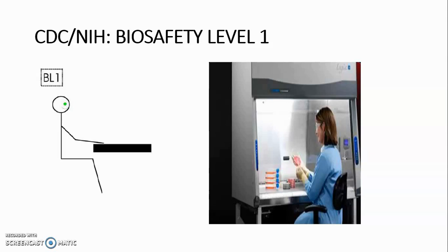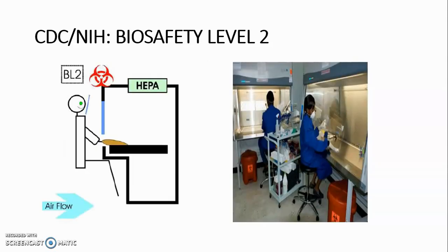Biosafety level 2 contains agents associated with human disease — microorganisms of moderate potential hazard transmitted by contact, ingestion, or puncture. BSL-2 is generally required for any human-derived blood, bodily fluids, or tissues in which the infectious agent may be unknown. Agents include measles virus, Salmonella species, pathogenic Toxoplasma, Clostridium, and hepatitis B virus.